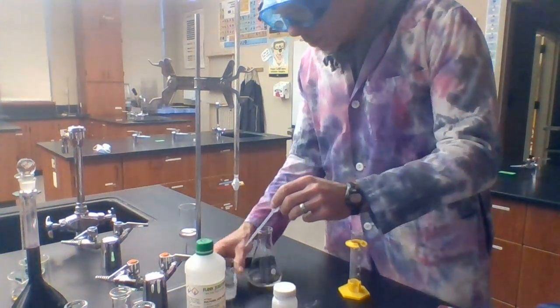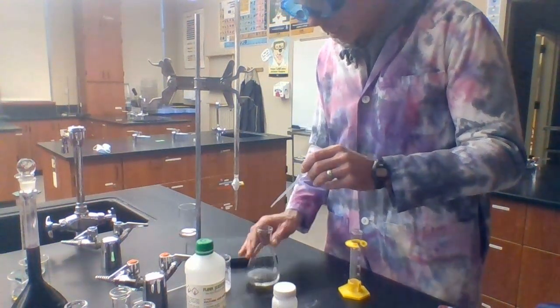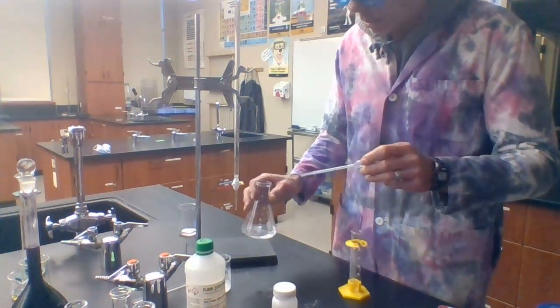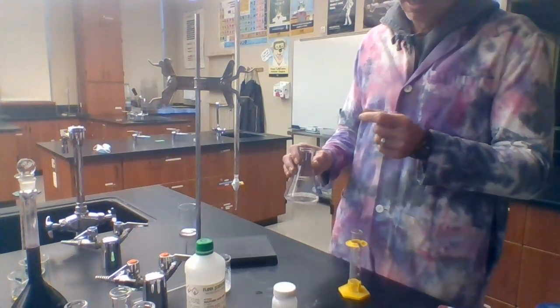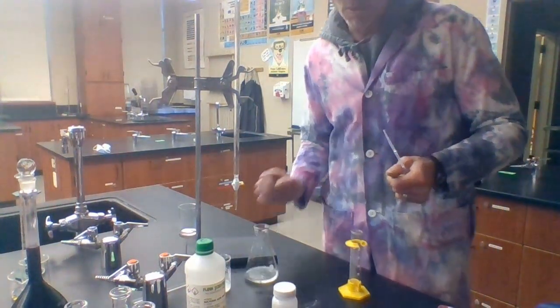I'm now going to add a few drops of the phenolphthalein to my analyte — my sulfuric acid solution. Notice it's remaining colorless because it's in the presence of an acid. That indicator is going to allow me, as I titrate, to know when I've reached the equivalence point — the point at which moles of acid equals moles of base. That's the endpoint of my titration.